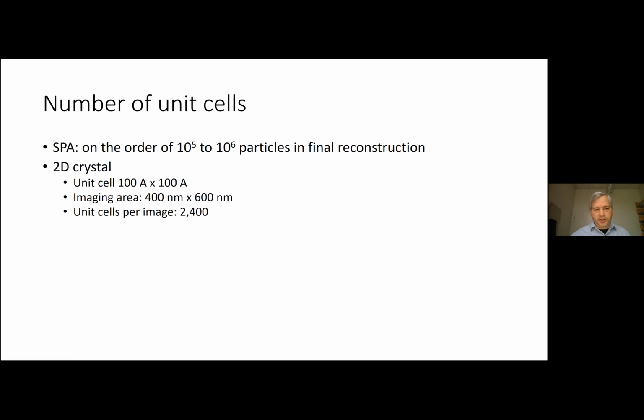It's not like single particle, where you're sort of doing crystallization in silico. You're aligning everything. The computer's aligning everything. Here, the thermodynamics are aligning everything. So your calculation is a lot less because you have a lot more pre-aligned data to work with.